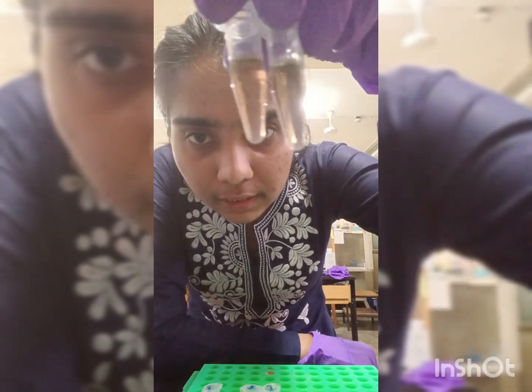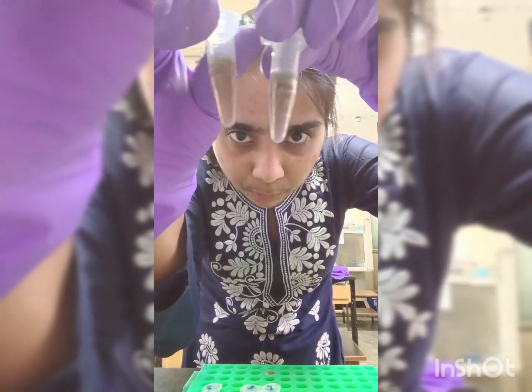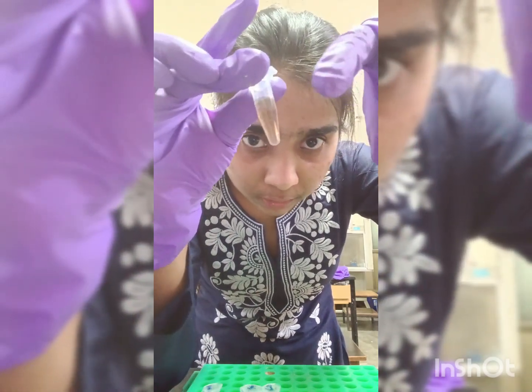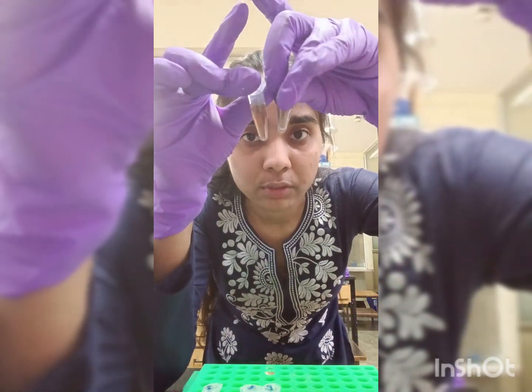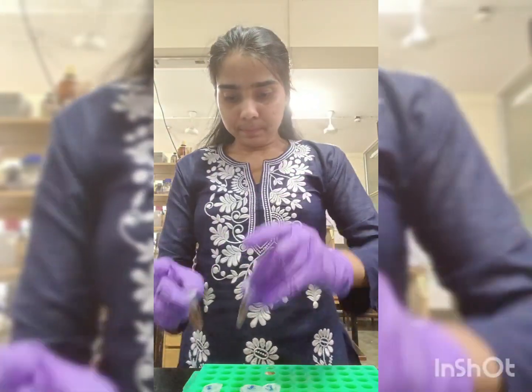Maybe you can see the color difference between these vials. This is the blank and this is the protein added. This one is more bluish black in color compared to this. So you can check the color of these two vials and see that there is protein. Now I need to check the concentration, so now we will do that.